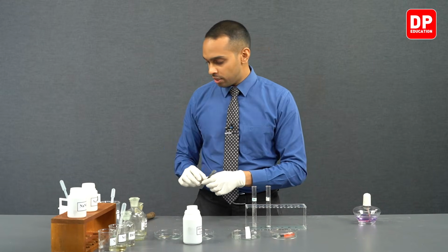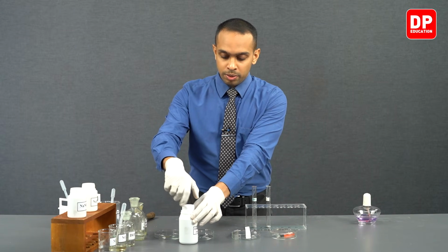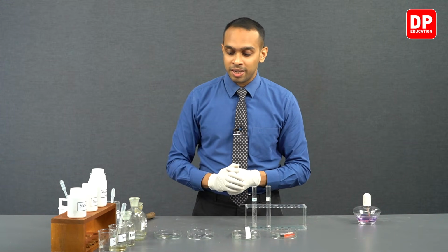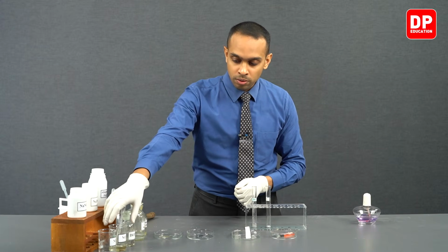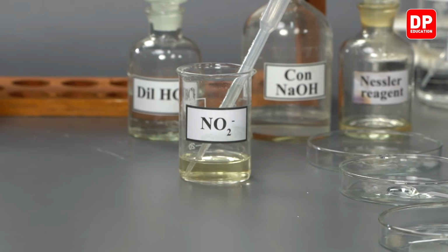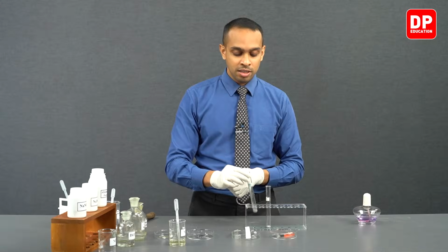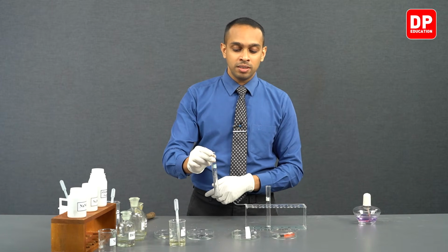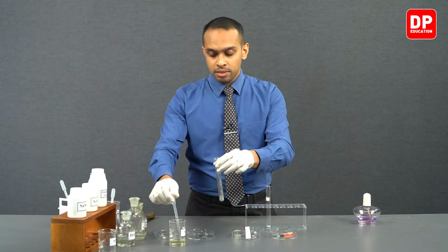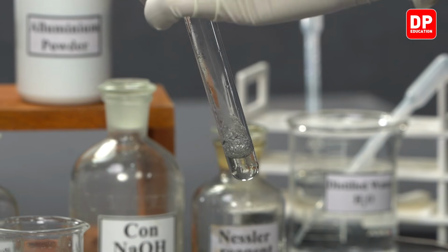Now let's place this aluminium powder bottle over here, and we can now take a small volume of nitrite ions first, and then add this nitrite ion solution into our test tube labeled nitrite. So let's add a small sample of nitrite ion solution to this test tube.